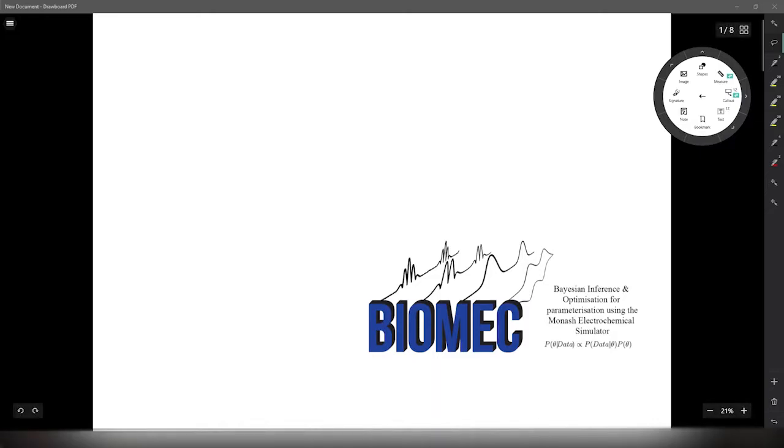Afternoon, my name is Luke and I just wanted to run you through my 4-part series on how to use Bayesian inference and optimization, BIOMEC, which stands for Bayesian inference and optimization for the Monash electrochemical simulator, BIOMEC.